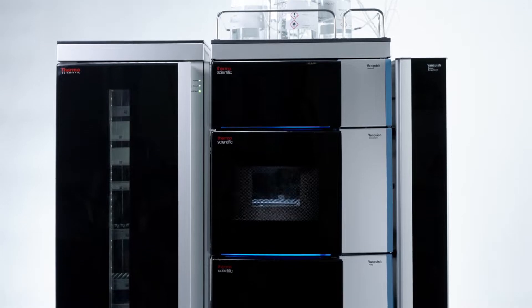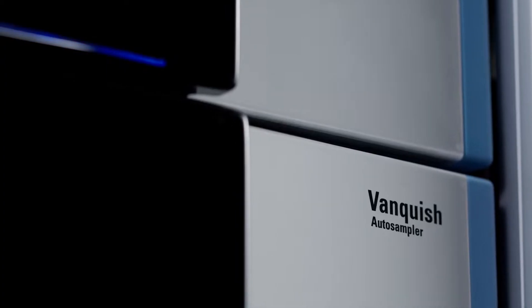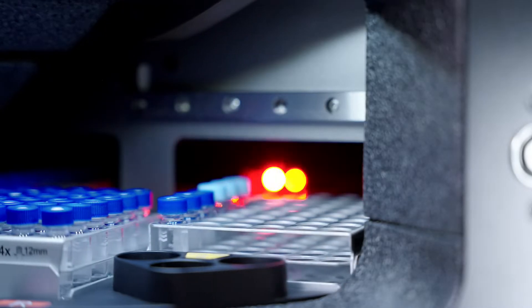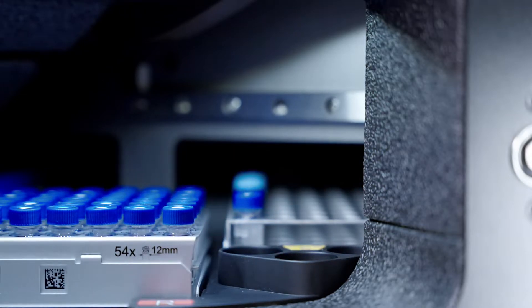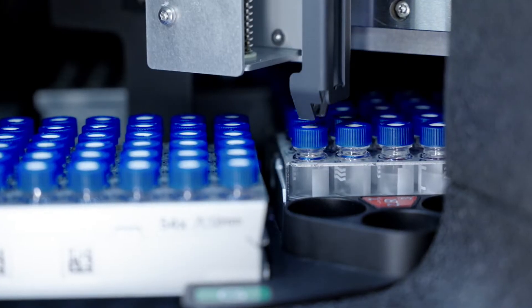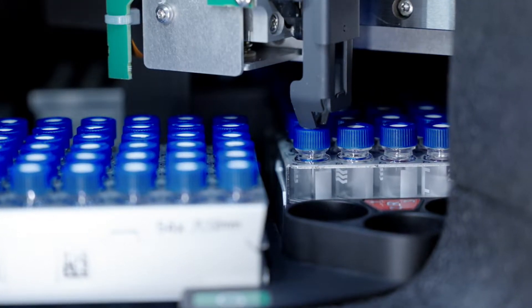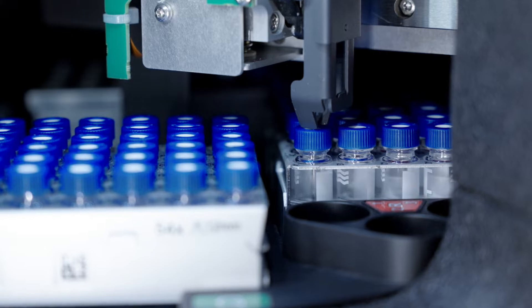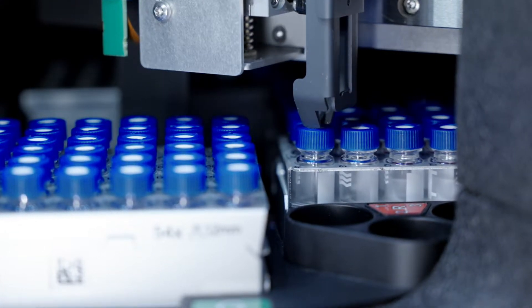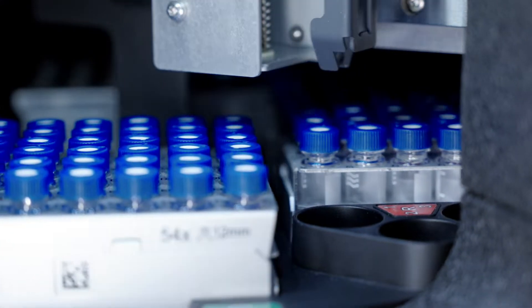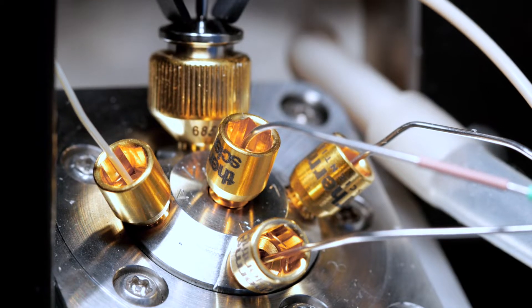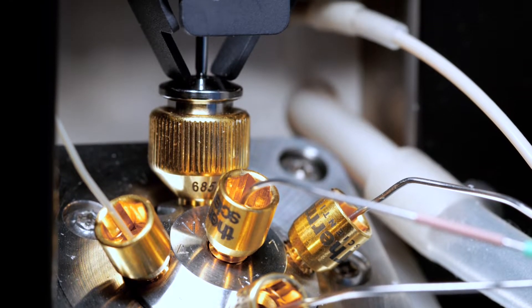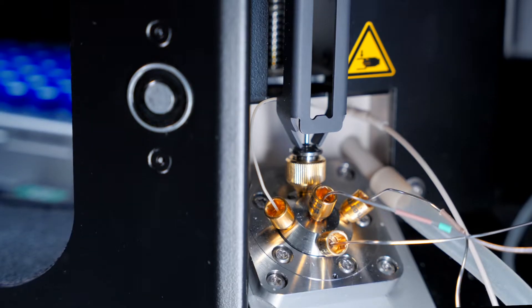The cutting-edge, automation-ready Vanquish Split Loop Auto Sampler redefines sample introduction with a unique metering device for high injection volume linearity and precision. Low-dispersion fluidics with Thermo Scientific Viper finger-tight fittings preserve peak shape and maximize resolution for even the most challenging separations.